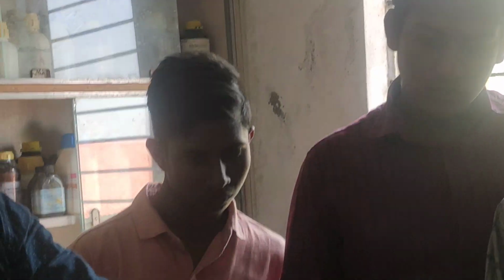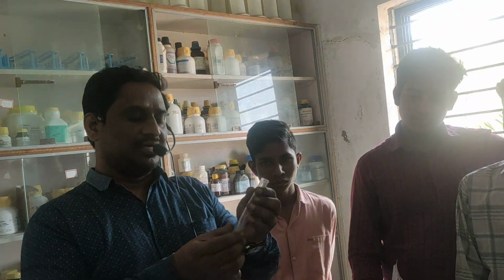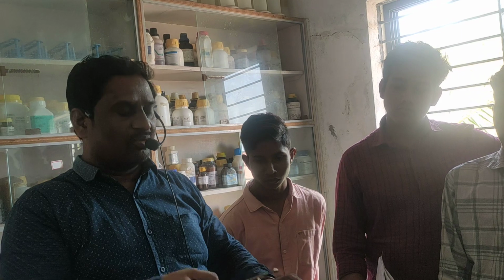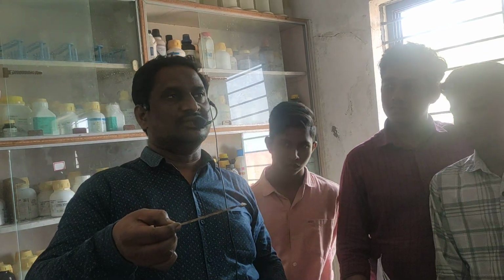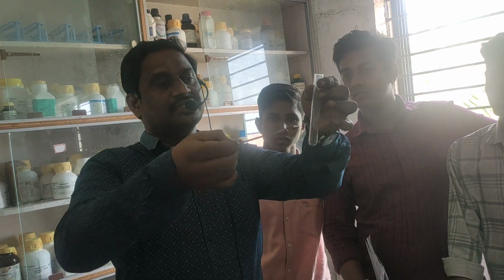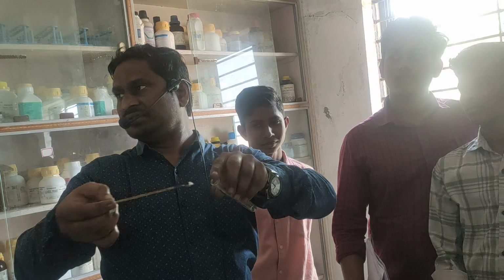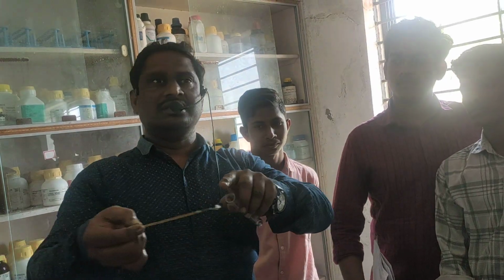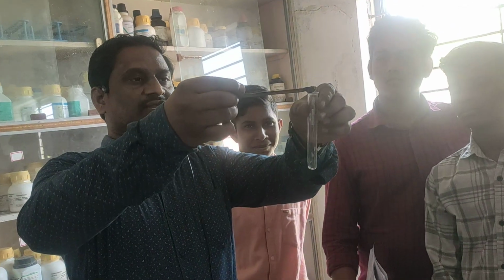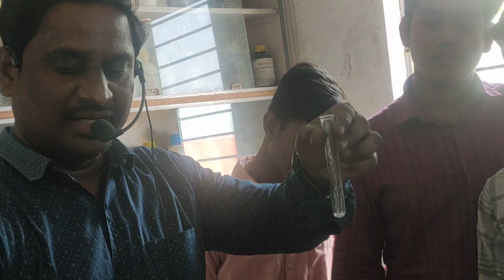So where will amorphous salt dissolve? In dilute HCl. Now I am taking a pinch of the given salt. For amorphous salt, don't take more salt, because if you take more salt, you should add more dilute HCl. So take very little, not even a pinch, and add dilute HCl.